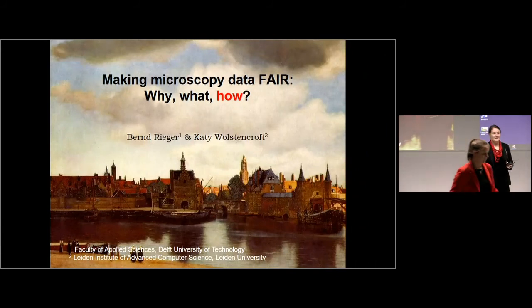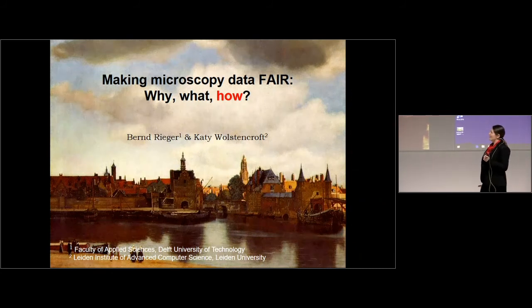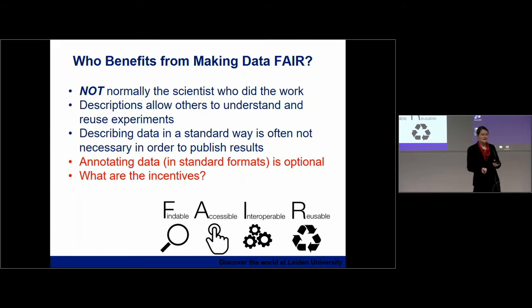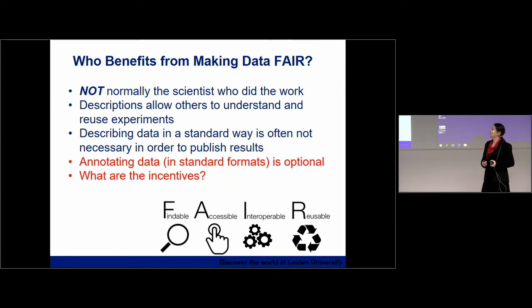Okay, thank you. So there are lots of reasons why we should be making microscopy data FAIR, and lots of reasons why it should be now, and I'm going to talk about how we plan to do that. But first of all, to add to all of the points that Bernd just made, we can all agree that there are some very good reasons for doing this. We can all agree, I think in this room, because we're all here, we must be interested in open science and FAIR data anyway, that these principles are very good ideas in general.